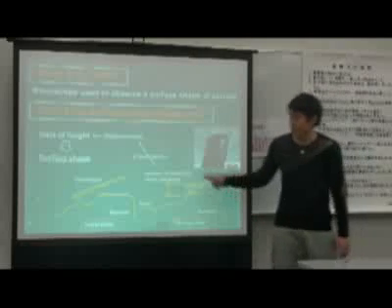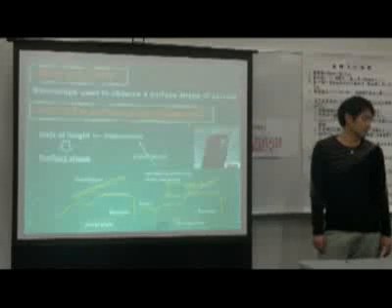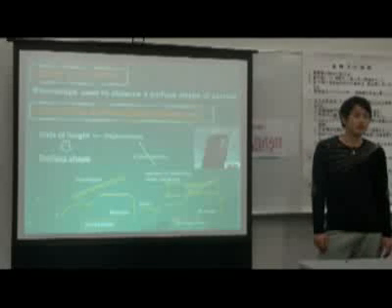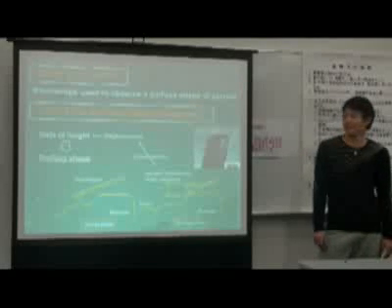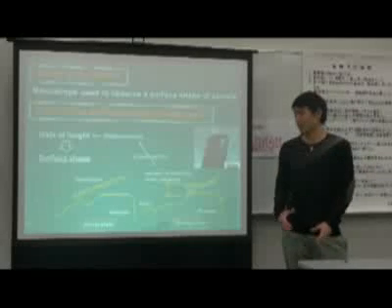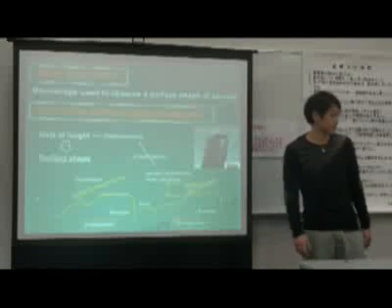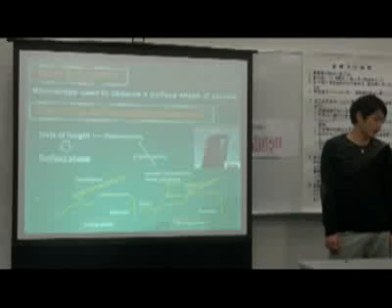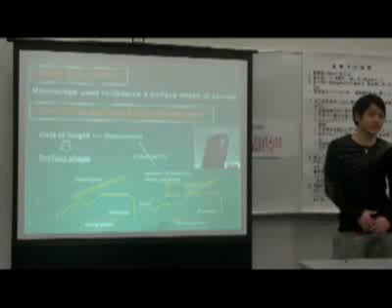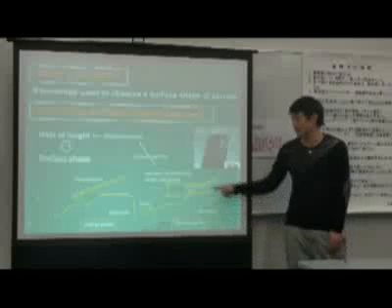Next, please look at this illustration. Z-axis direction means height. Also, X or Y direction means horizontal direction. In this way, as the scan starts, the cantilever is bent like this.